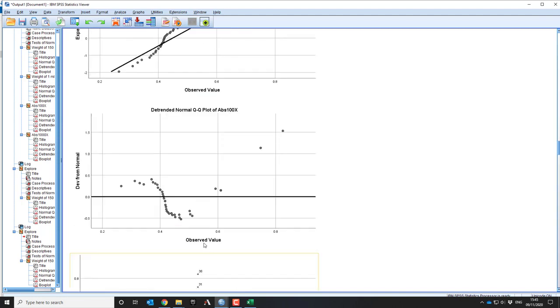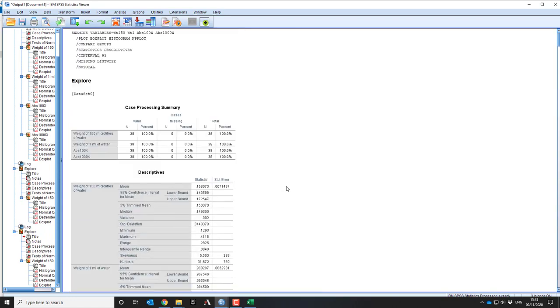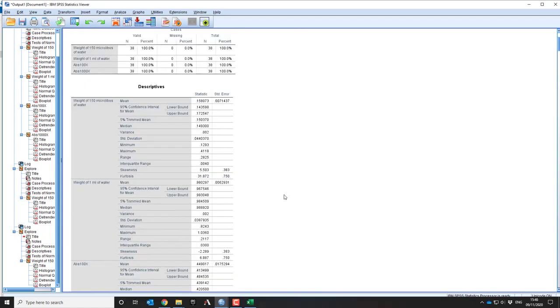So if I've got problem values like that, I then need to go back and think, why did they happen? Now this experiment is about learning how to use micro pipettes. So what probably happened is a person misused the pipette. So overpressed it, or pressed it down to the second stop when they only wanted to do the first, or did not expel the material correctly.